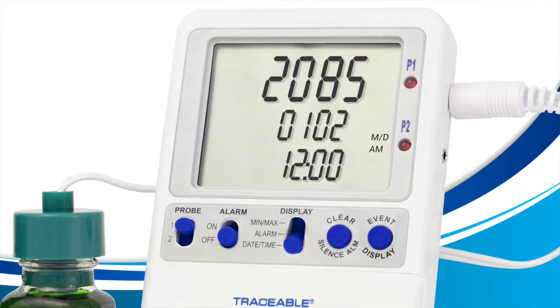Currently, mine is set to show the month first and then the day. We can tell that it's in this order because of the M/D located towards the right of the middle row. If we press the Event Display button, the order will change to day first and then the month. You can tell that it's this way because the M/D has changed to D/M on the right.